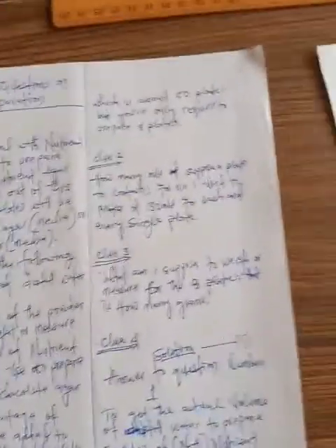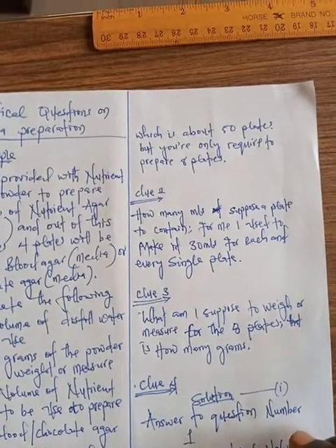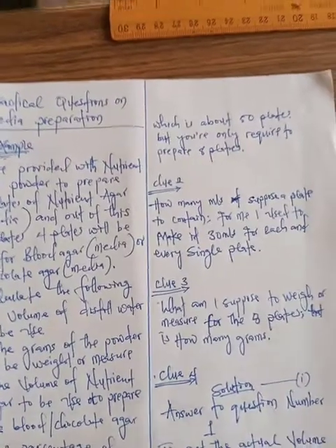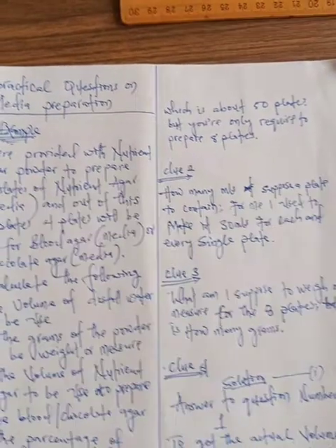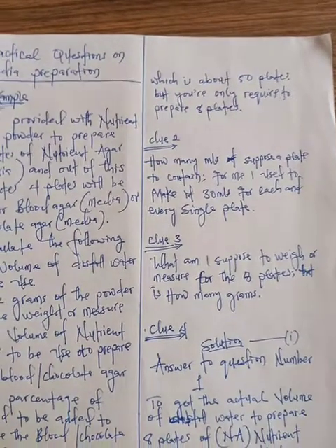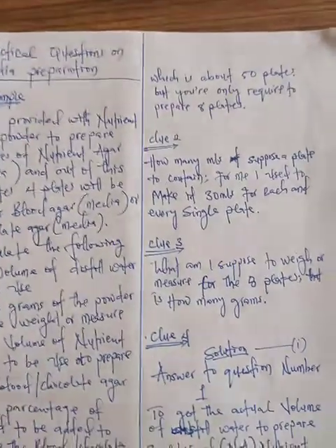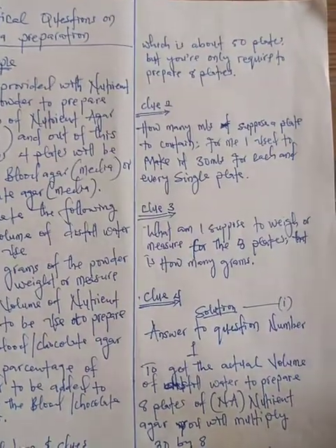So the next step: the manufacturer's amount may be for about 50 plates, but you are only required to prepare 8 plates. Okay? Now, the next clue is, how many mls is a plate supposed to contain? That is what you are supposed to ask yourself. For me, I used to make 30 mls for each and every single plate. That is, for one plate, I'll prepare 30 mls. But sometimes, according to some textbooks, you will see 20 mls.